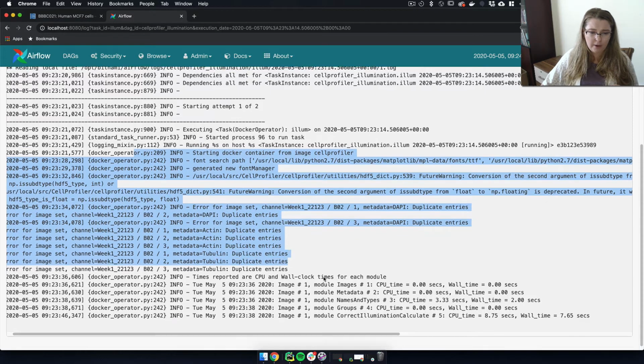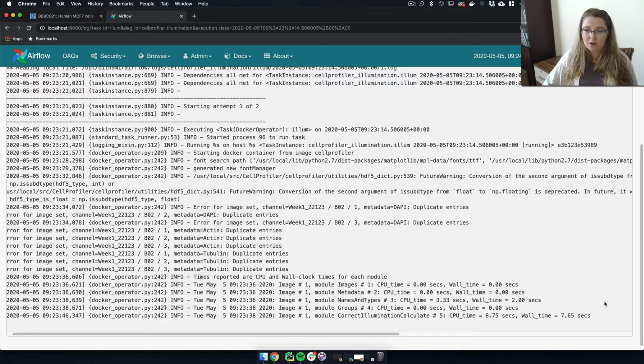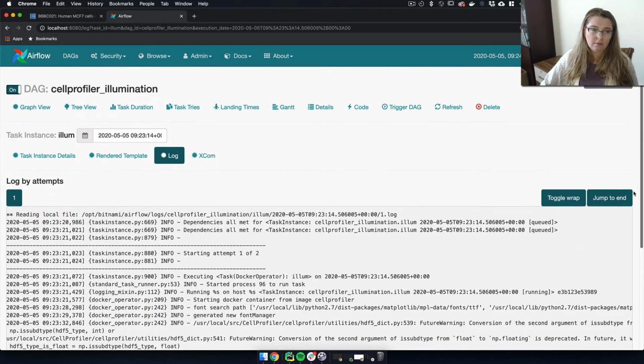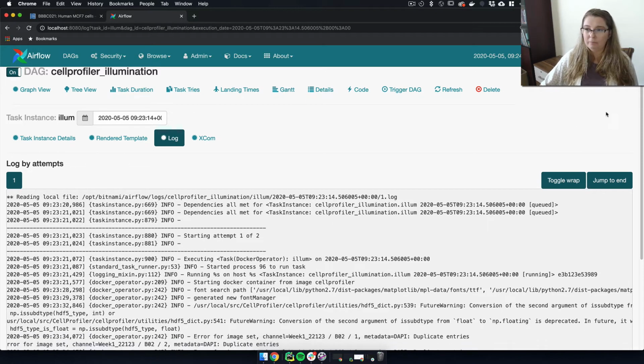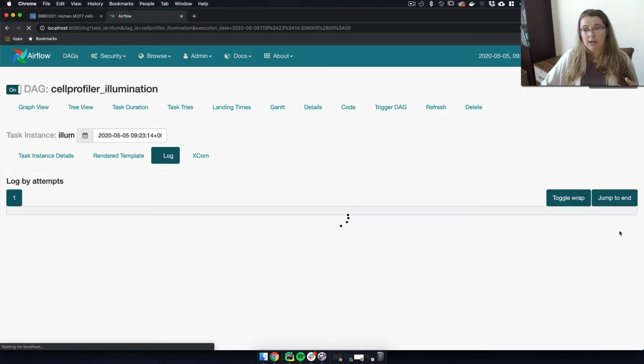Okay, so this is CellProfiler output. It hasn't complained at me that it can't find anything. Everything is good. So you can see that this is going here. And I hope you can see how this gets to be extremely powerful as you go on, because think about it. You have your job queuing, you have keeping track of state, you have keeping track of logs transparently. I think all bioinformatics people like to write our own systems that do this. And I too wrote one, keeping track of the states and the logs and where the logs go and how you nicely access logs. It's a much bigger deal than you would think. So having a system that does all this for you is very, very, very nice.